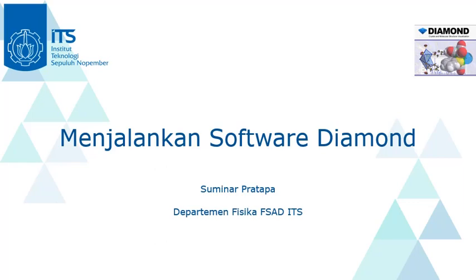It is part of Research Data Analysis course. This presentation is about how to run the Diamond software. With this software, you will be able to visualize crystal structures and their calculated diffraction patterns.